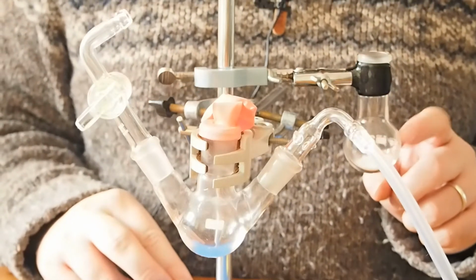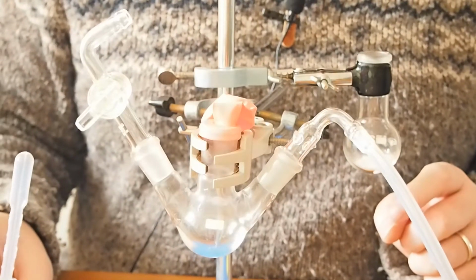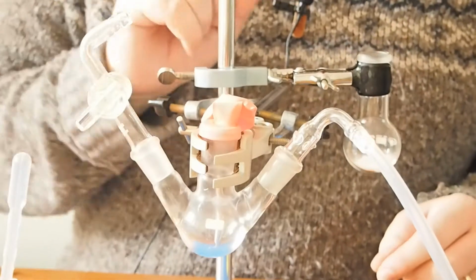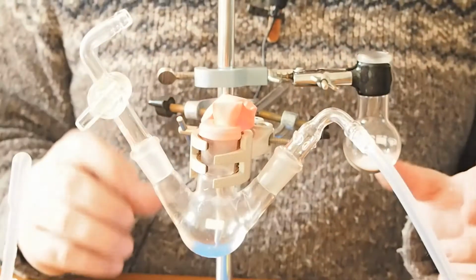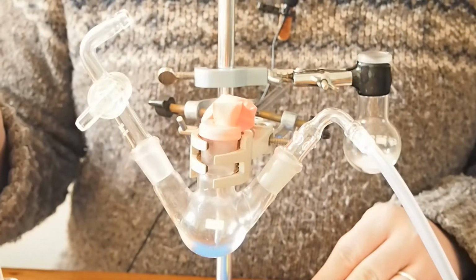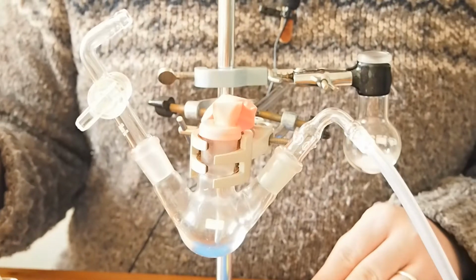Now I've got some sodium carbonate in here, and when I add my acetic acid, I'm going to get sodium acetate generated in here, but crucially, carbon dioxide is going to get given off. You may have seen this in a volcano type experiment before. So if I add a little bit, let's see what happens.